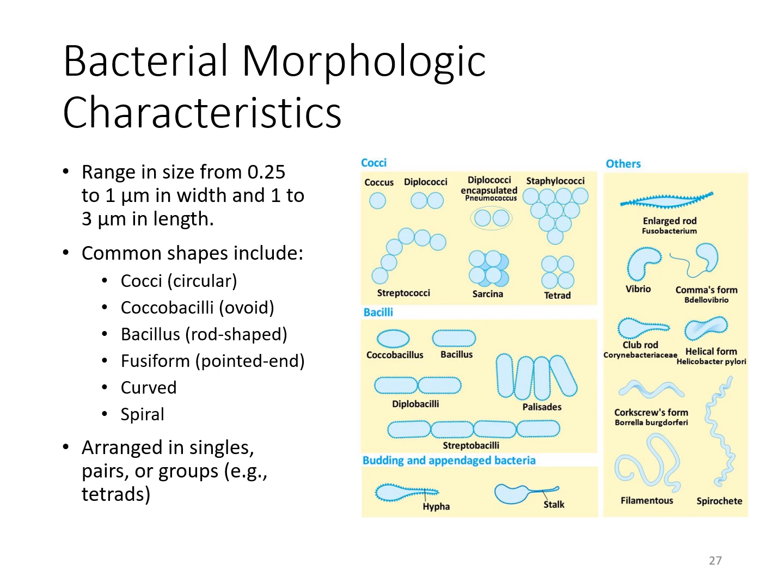With your bacilli, they also can be in the same formation or similar formation. And then you can also see on the side where you have your fusiform type bacteria, where it's kind of got pointed ends. And then at the bottom you can see your spirochetes or your corkscrew formed of bacteria.